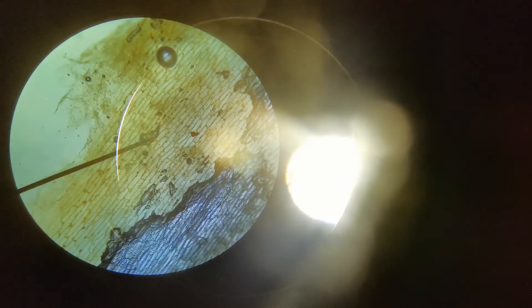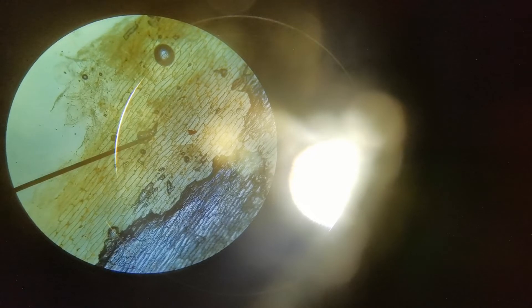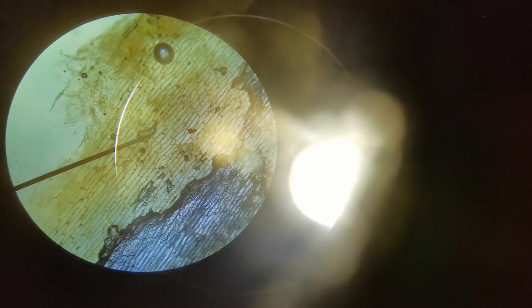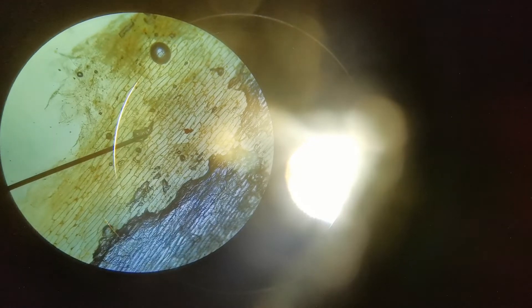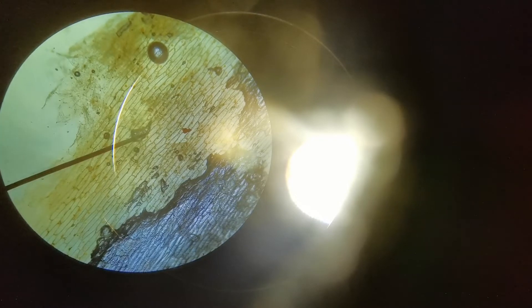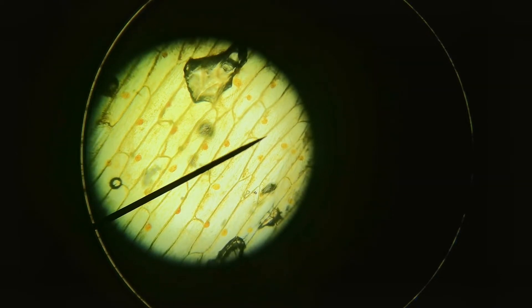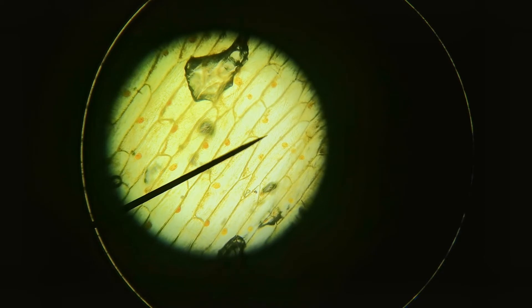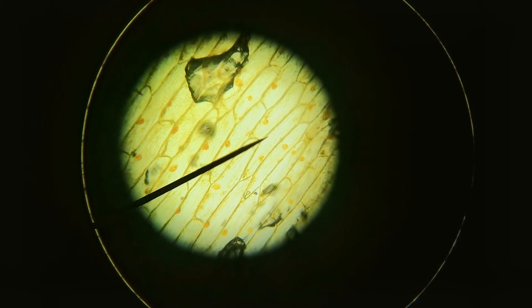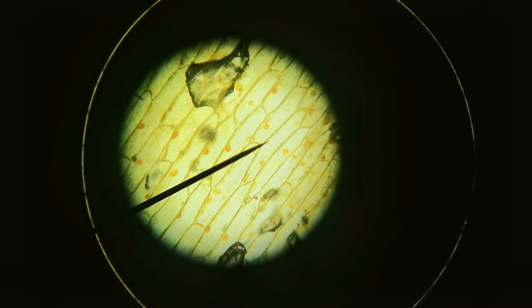This is what you can see through the objective lens with the lowest magnification, times 4. Each of those little compartments is an onion cell. If you look closely you can see dots in the middle of each cell — that's the nucleus — and the lines around each compartment are the cell wall. This is with the objective lens at times 10, so you can see the onion cells in a lot more detail. You can see each compartment, the nucleus, the cell wall, and the substance around the nucleus is the cytoplasm.